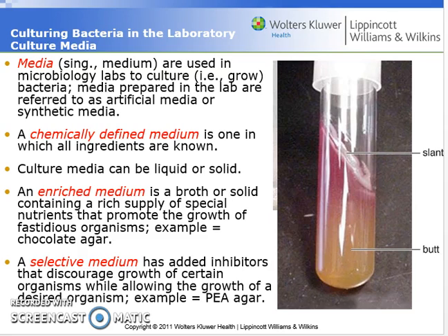But there are some other enriched mediums out there where you can add things such as salt, such as mannitol salt agar plate. Salt will inhibit the growth of gram-negative organisms like E. coli, but the mannitol sugars inside of the agar plate will actually enhance the growth. So in a sense, it can be referred to as an enriched medium.